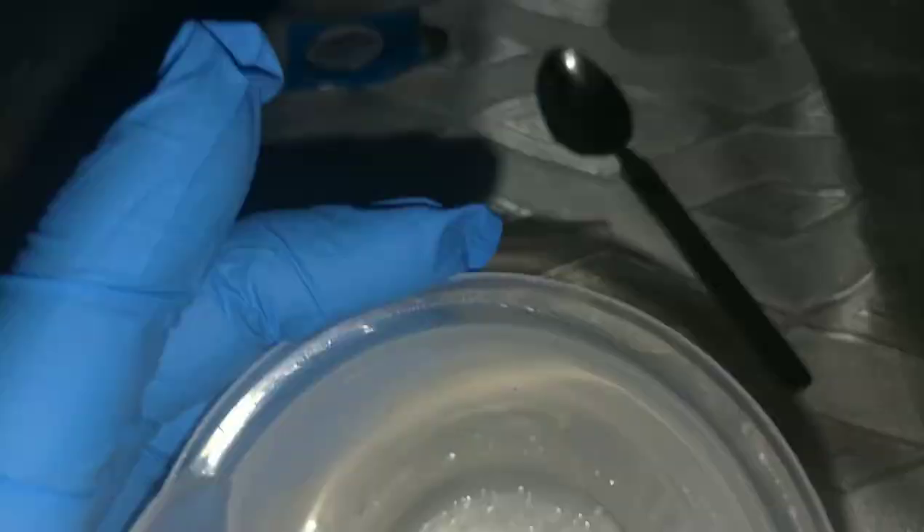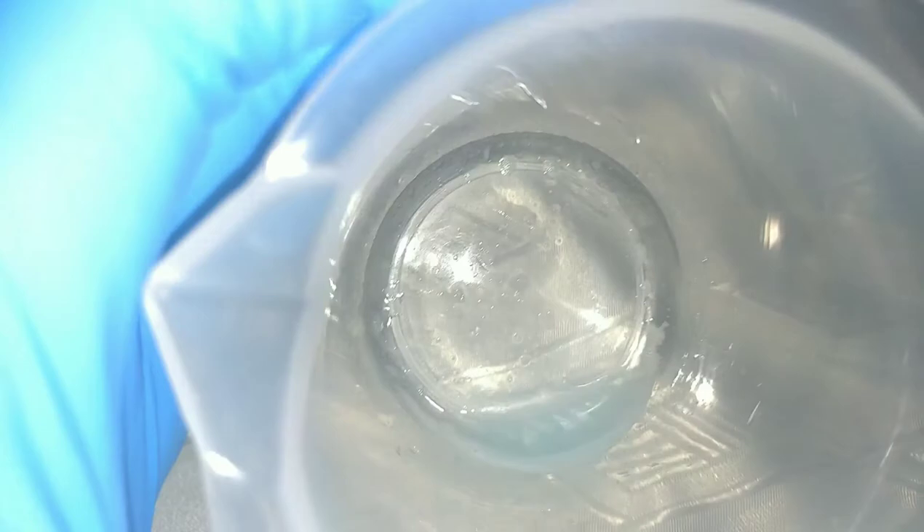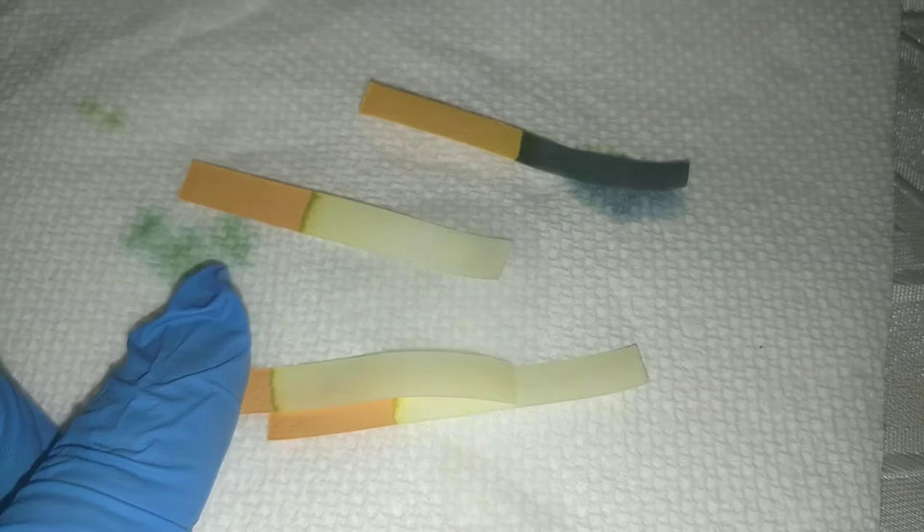I've decided I won't be measuring out exactly one milliliter each time because it takes very long to clean between tests. I think I'll get the same results from just adding enough to cover the bottom and then testing. Now we'll be testing the ammonia — it's a deep blue. The bleach ones have turned completely white, but this ammonia strip is dark blue, so I'll put it down as 11.